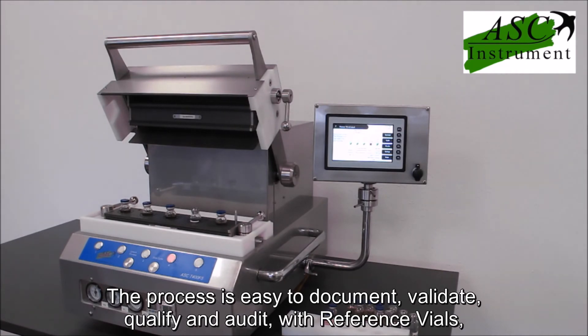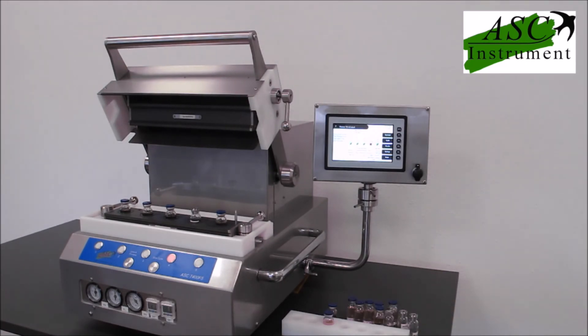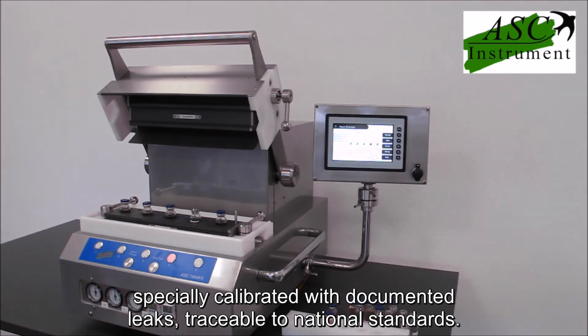The process is easy to document, validate, qualify and audit with reference vials specially calibrated with documented leaks, traceable to national standards.